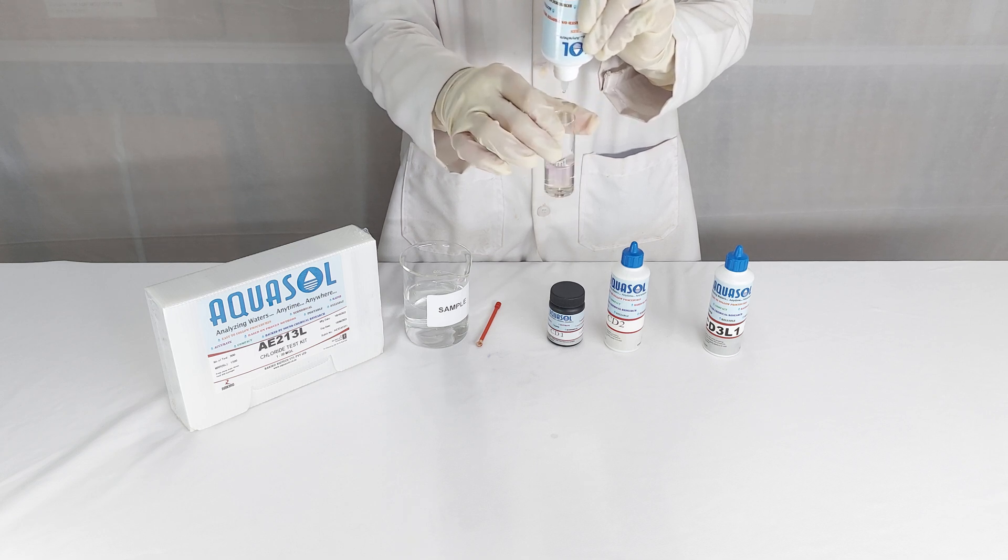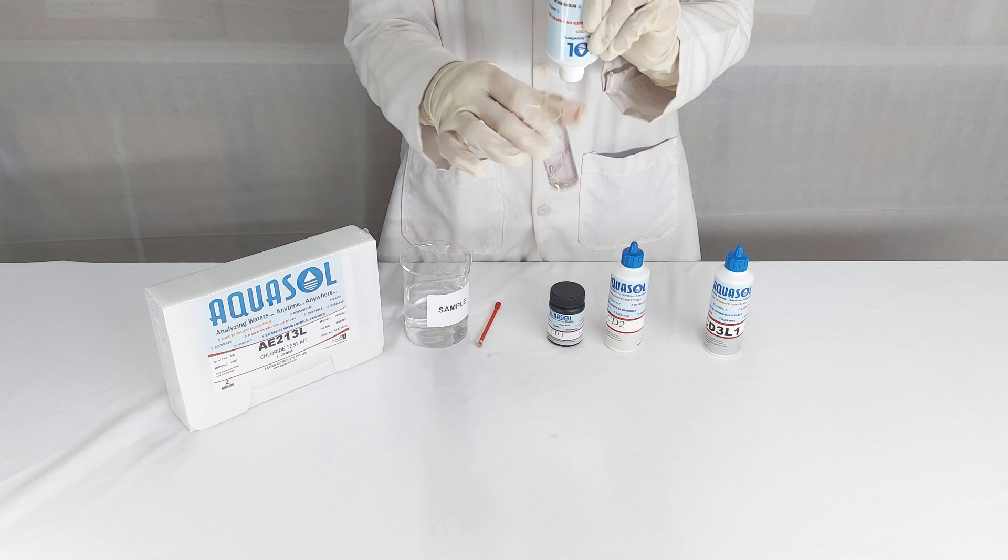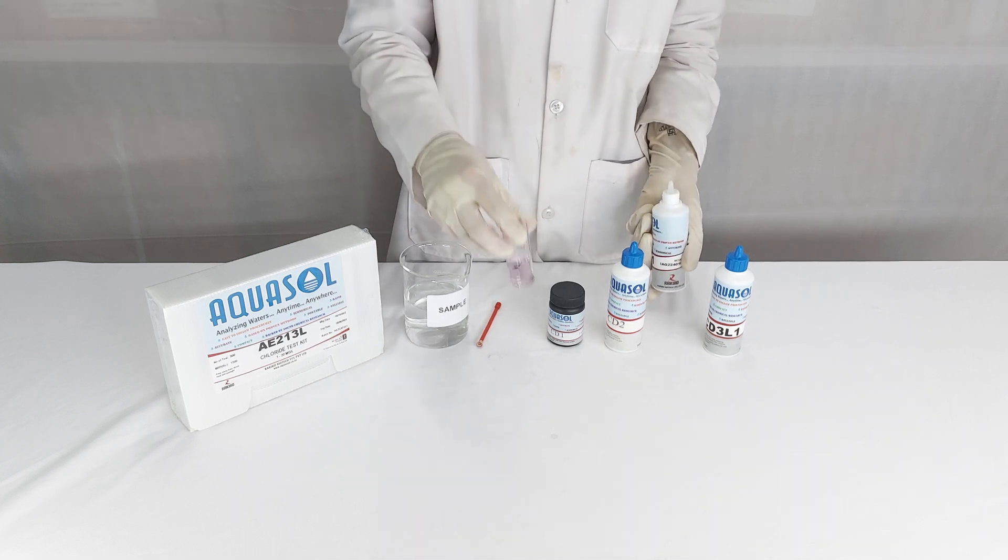Calculation: The number of drops of CD3L1 reagent multiplied by 1 is the chloride of the sample.